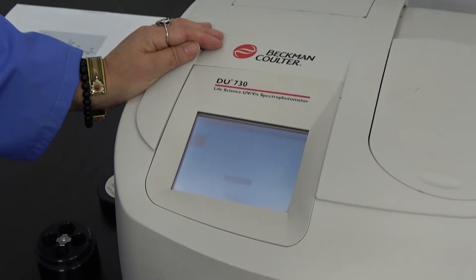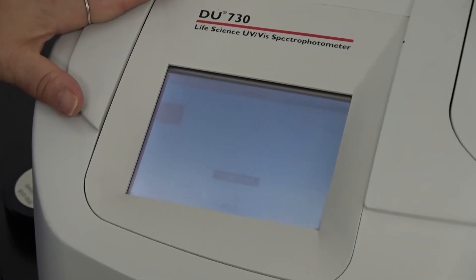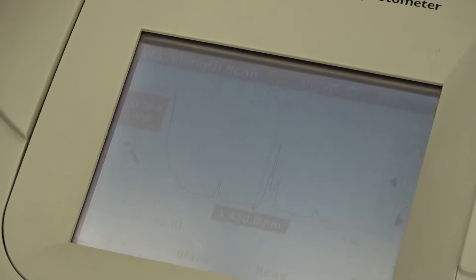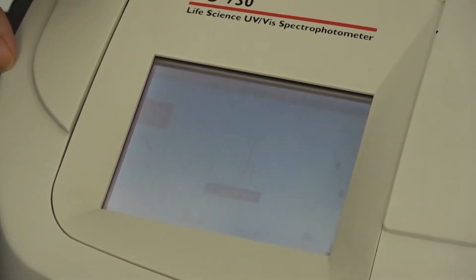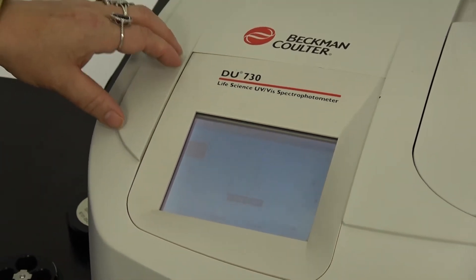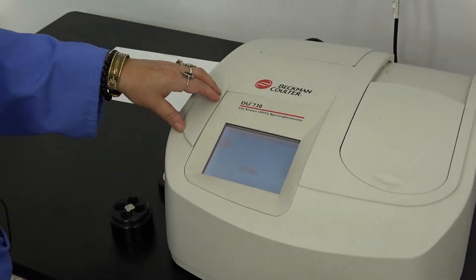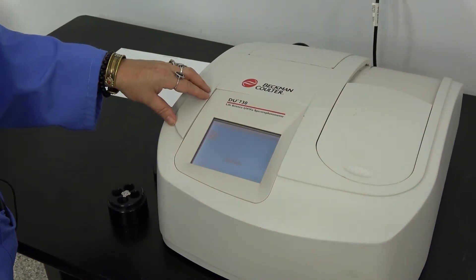It has powerful but simple software servicing a wide array of applications including fixed wavelength, wavelength scans, kinetics over time, simple component analysis, protein assay analysis, nucleic acid analysis, dye incorporation, and DNA or protein tools. There's up to 50 user protocols that can be created and stored and quickly recalled and applied.